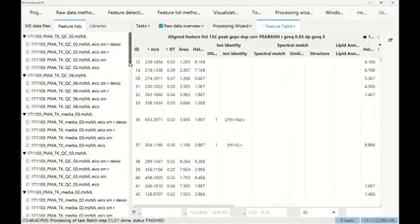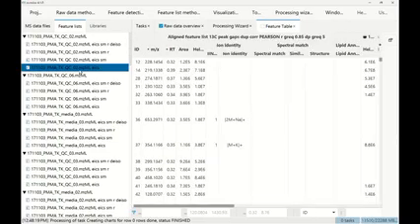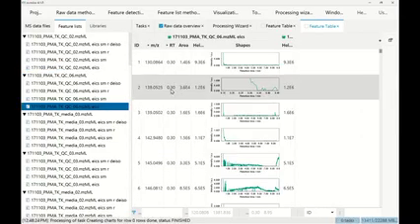And so why do I have so many feature lists now? For each file, we generate one feature list for each step. Typically, the first step is that we generate the extracted ion chromatograms.